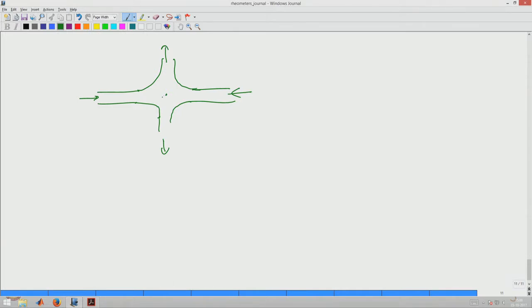So, if you keep the molecule here and then by manipulating flow rates, you can actually manipulate the amount of strain rate that is being felt by whatever is at the center. And so, you can do microscopy, you can do some observation, you can do spectroscopy and then try to examine what is happening to the molecules or particles which are being examined under extensional flow. So, therefore, this is a cross slit example of achieving extensional flow.